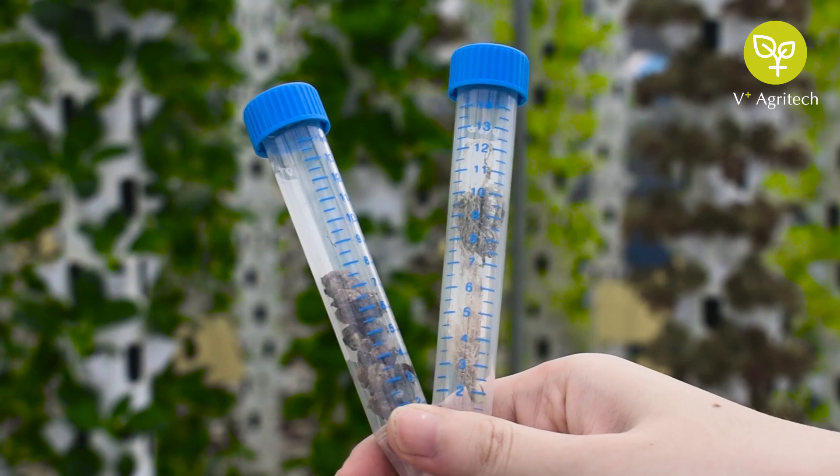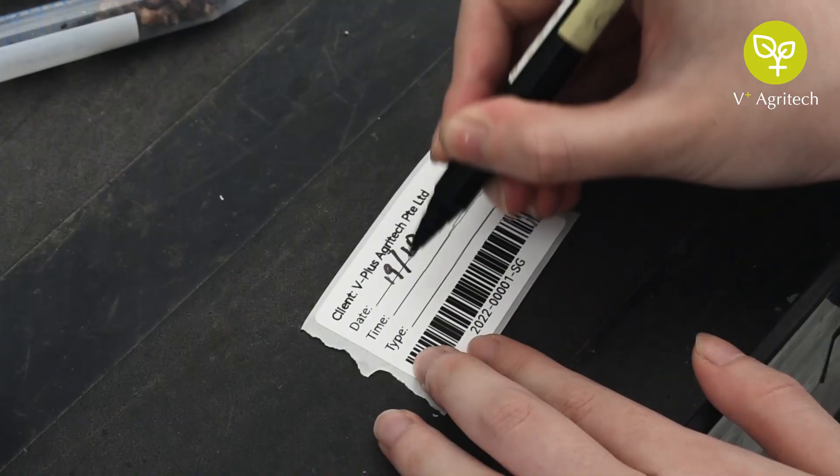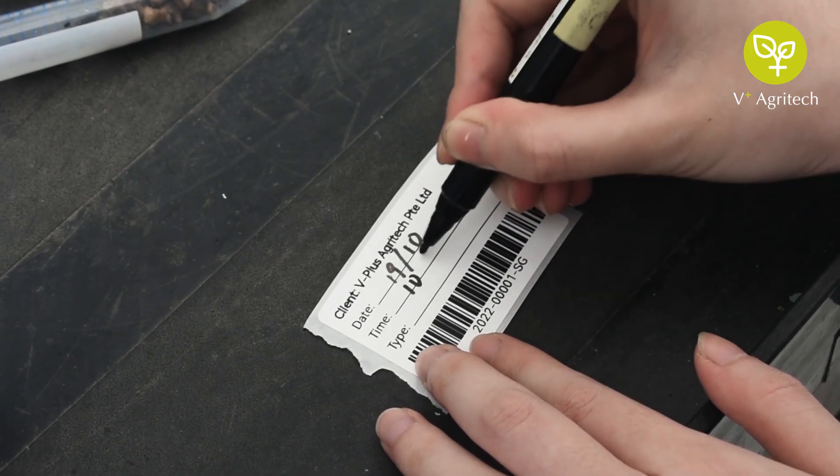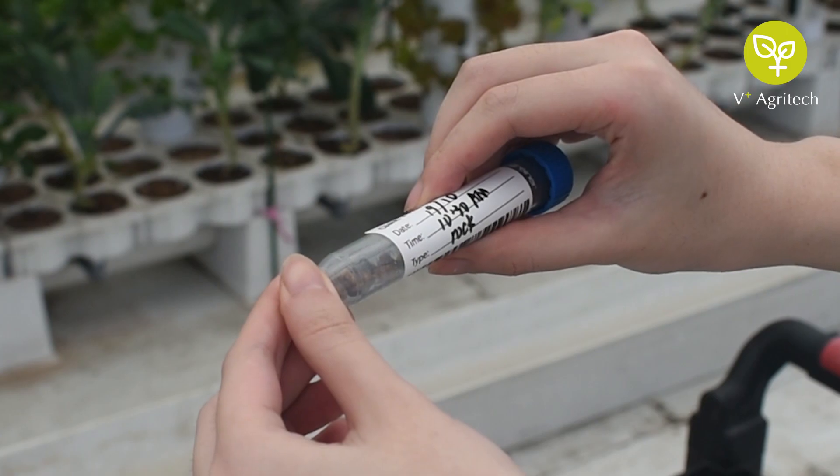If multiple samples are taken, separate the samples based on their types. Write down all the details on the given return labels and stick it to the corresponding samples.